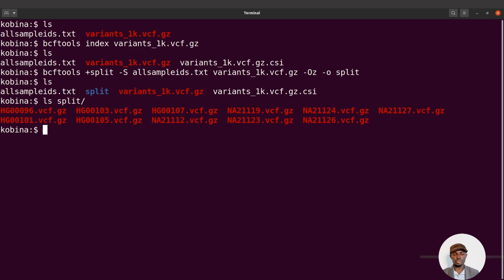This is very important. You should always make sure you apply it or do it, depending on what you have. You may be dealing with raw VCF files or VCF files that have already been processed. No matter the situation, there is something you need to also check. Now, let's take a look at one of the samples, for example.